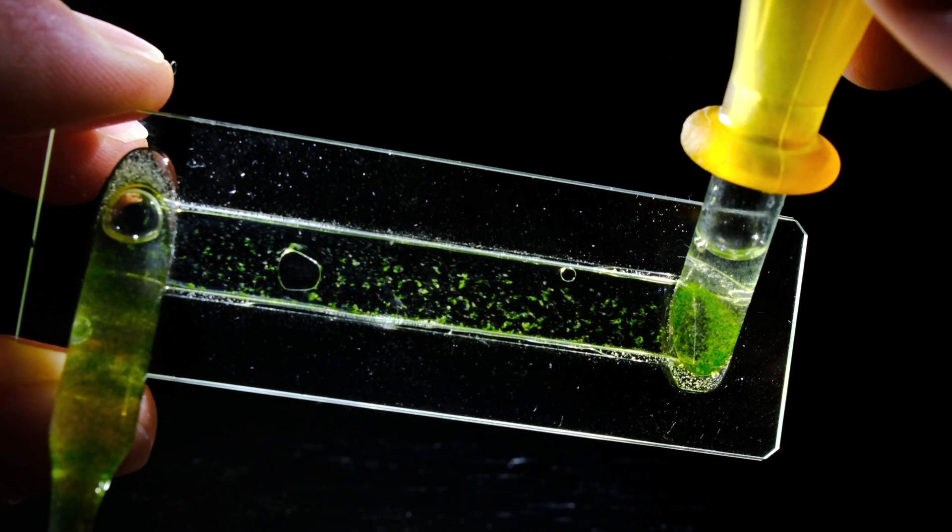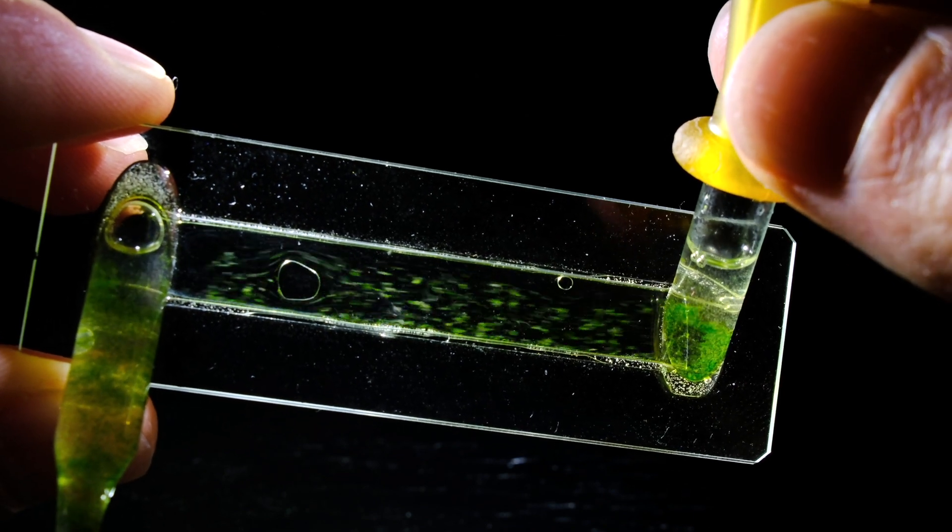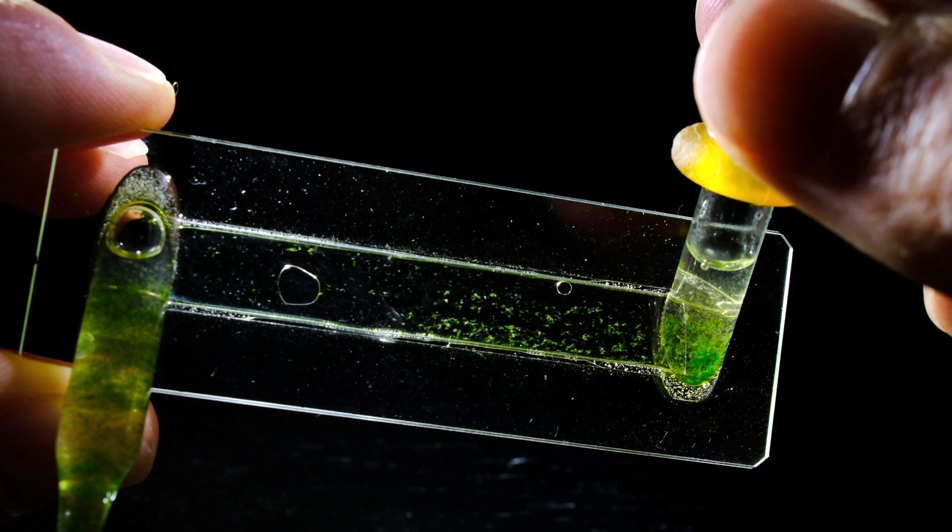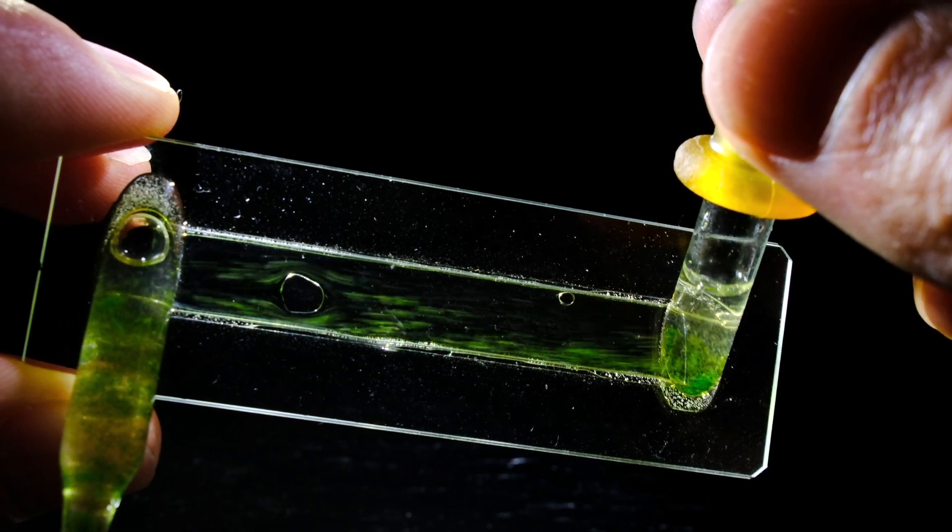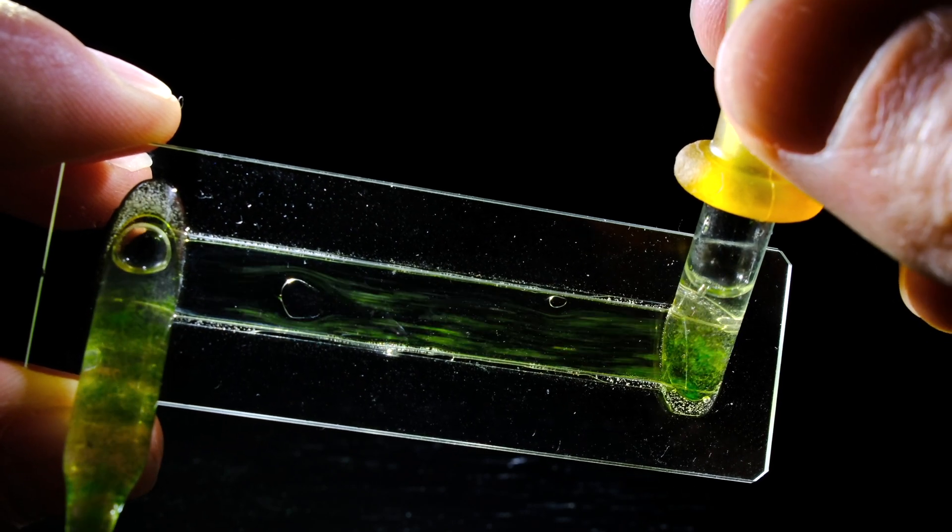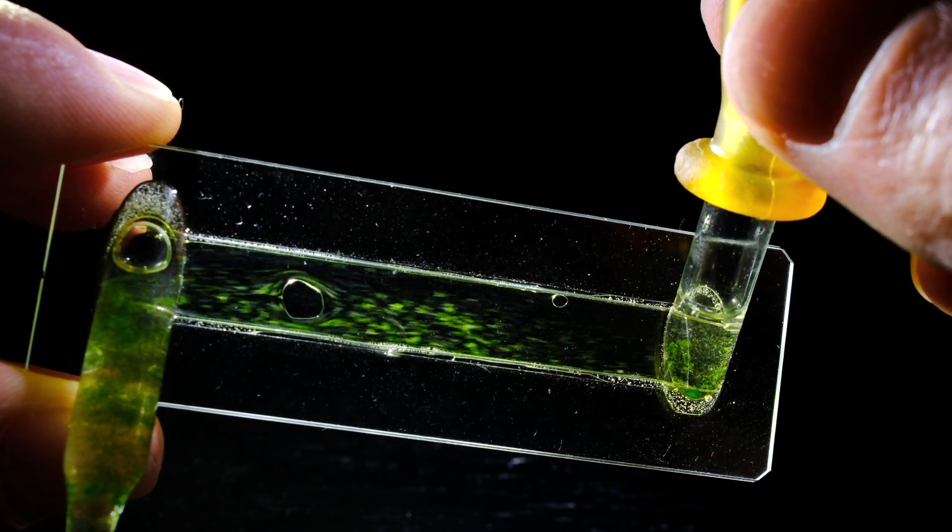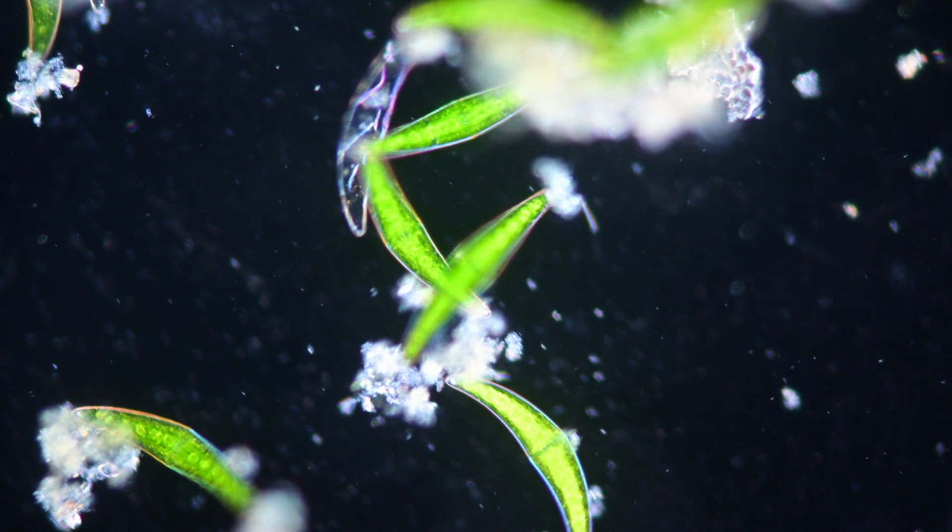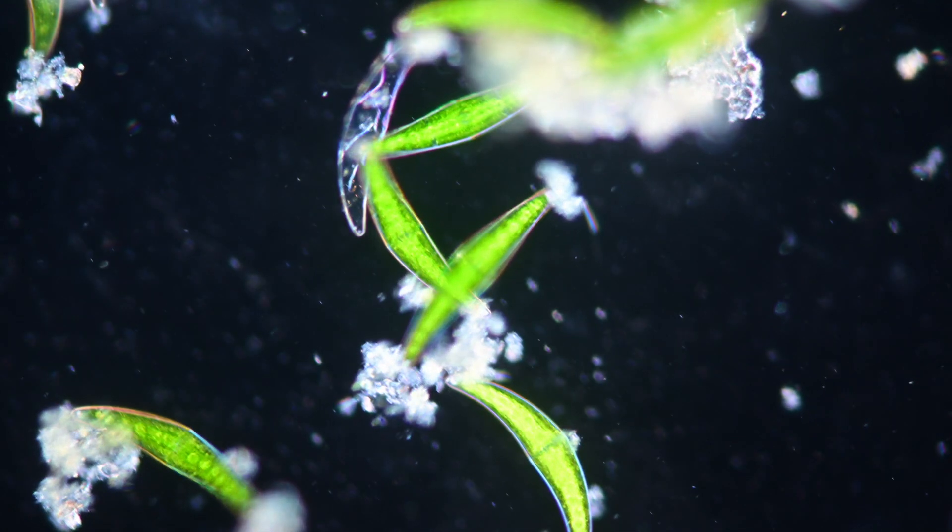I already have some experiments in mind I want to do with it, and I will let you know when I get some results. I will definitely bring it to Japan this year, and let's see what we find. There's a really interesting creature lurking in the sea around Okinawa. It's a swimming tardigrade that swims like a jellyfish, and I want to film it with this pipette.